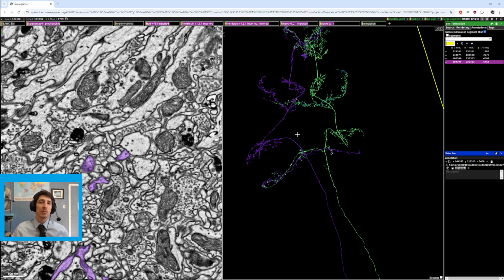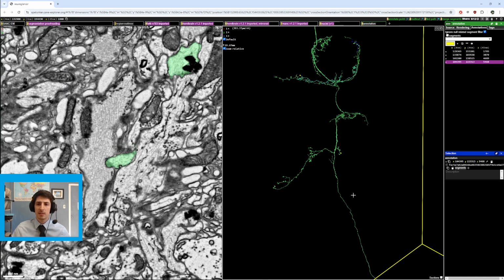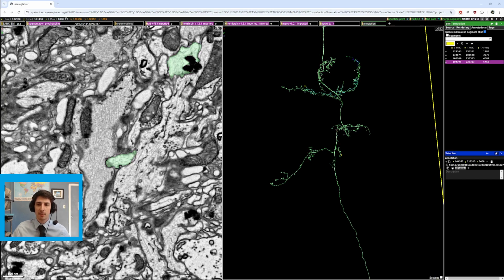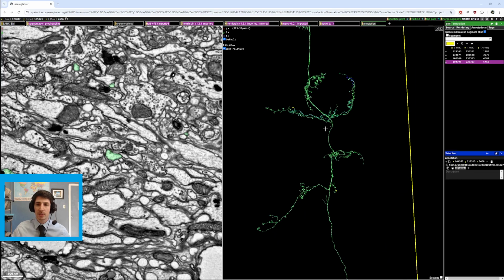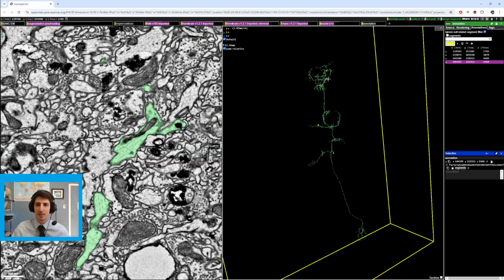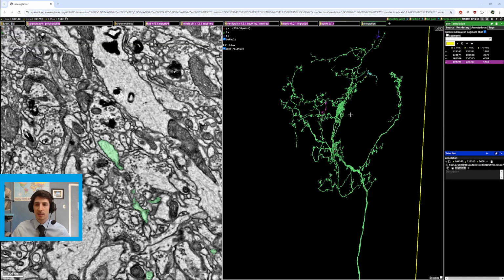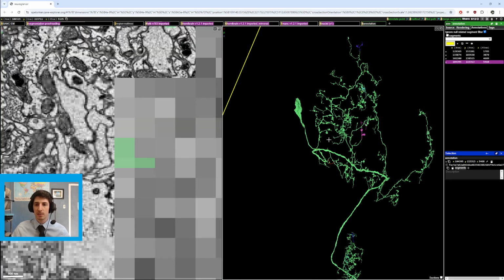So that's how you use two similar looking cells to help yourself trace. If you don't have a similar looking cell, some of the things still apply. What you're going to want to do is check the tips of things. So if this cell wasn't here, you could say, well, the cell typically has branches that are about this length. So that's pretty much that length. This is similar length, but this area, that's not the same length. Up here, you can see this length, that length, similar length, even though it does a curly Q.